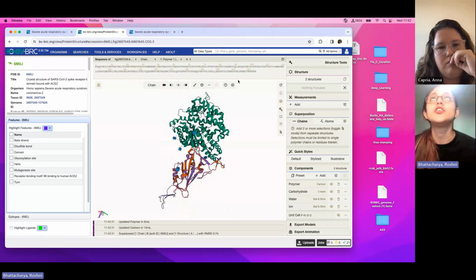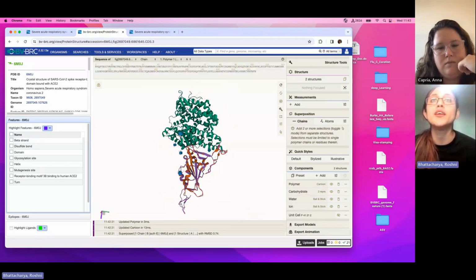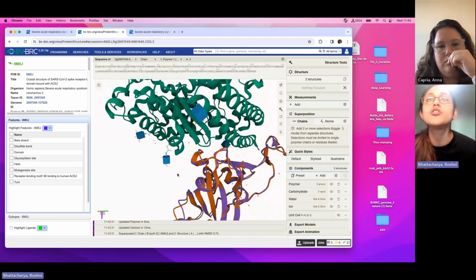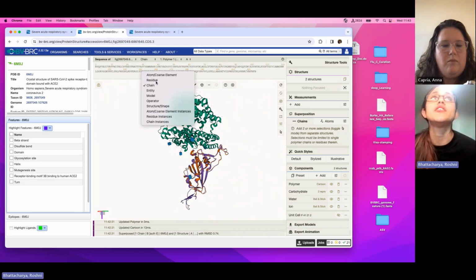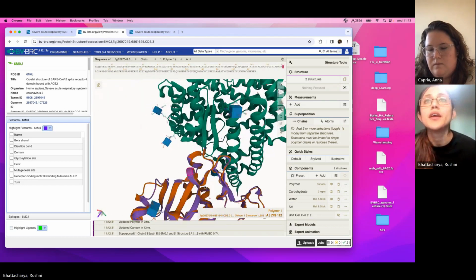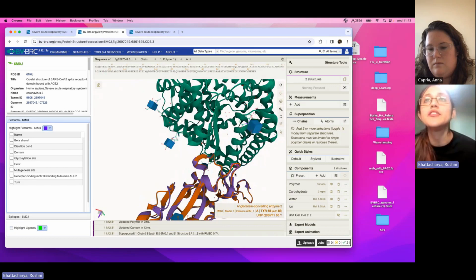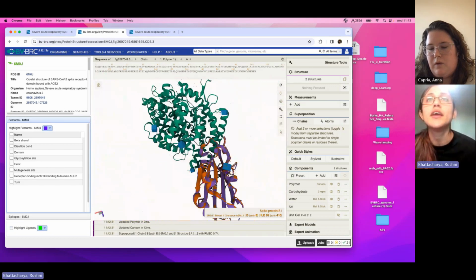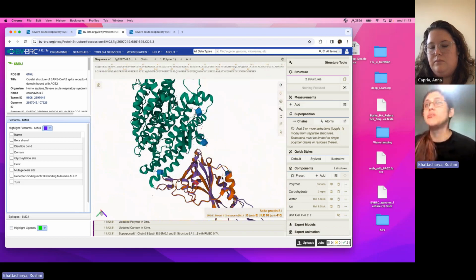Now you can see 2 chains superimposed. So one is violet, another is reddish maroon or something like that. And if you look closely, let me change this to residue because it's selecting. Yes, now it's better. You can see there are minor differences in the loop areas here and there, but mostly they are similar structure. They have the similar fold.